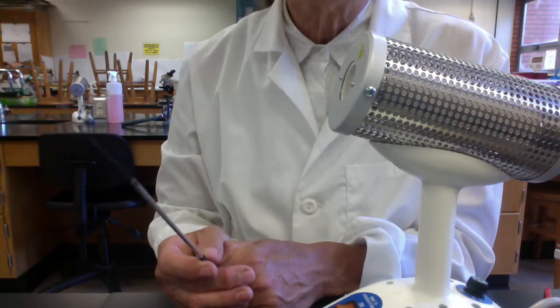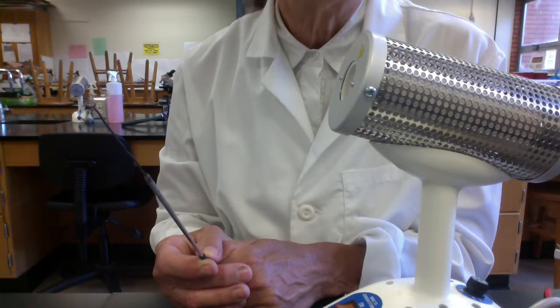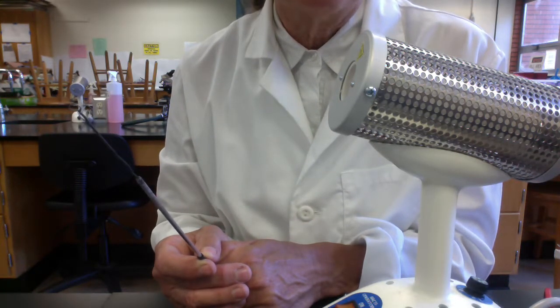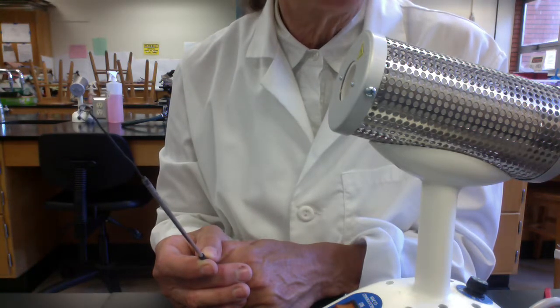And you want to make sure that the loop is allowed to cool before you touch your microbes. If you touch your microbes too quickly, the loop will be so hot it will incinerate your microbes. It will kill your microbes. So let your loop cool maybe five to 10 seconds.